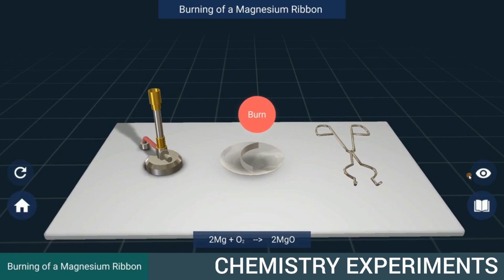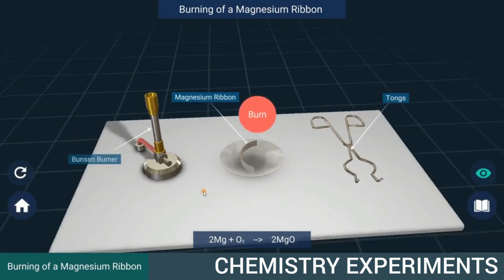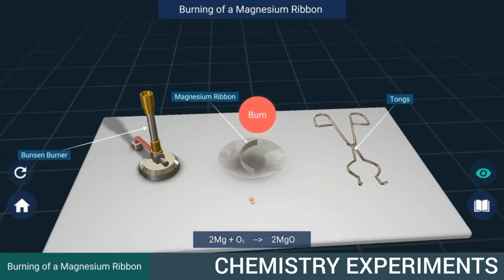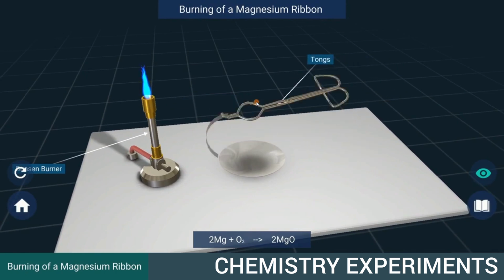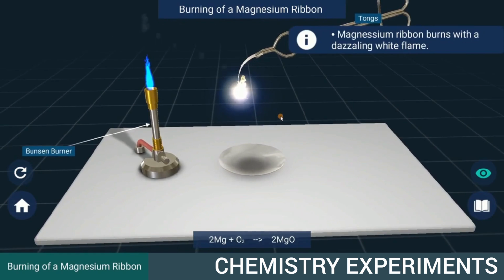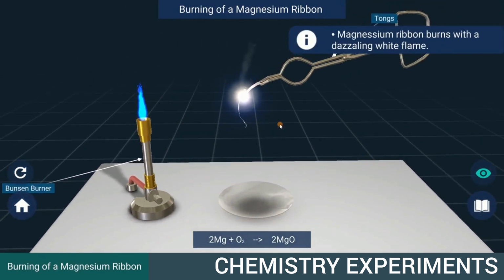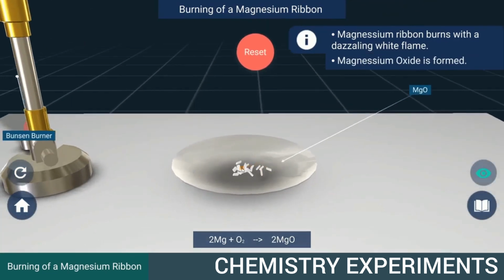We have taken a clean magnesium ribbon after removing the oxide layer from it, and a Bunsen burner. Burn the magnesium ribbon using a Bunsen burner and observe. We see that the magnesium ribbon burns with a dazzling white flame and changes into white powder.